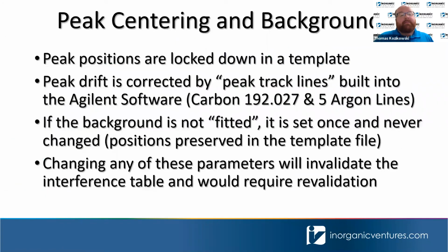So next, peak centering and backgrounds. Mike mentioned that this is critical. The peak positions are locked down in our template, so they never get changed. Their software package comes with a peak drift feature. You select the peak track lines. It's built into the software.